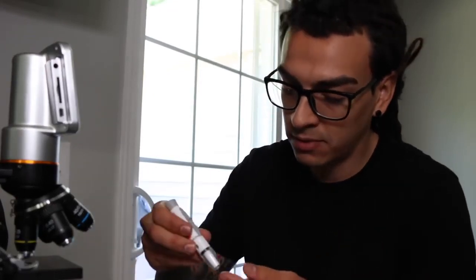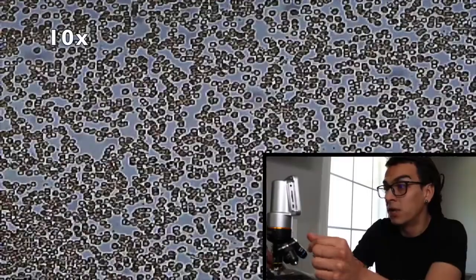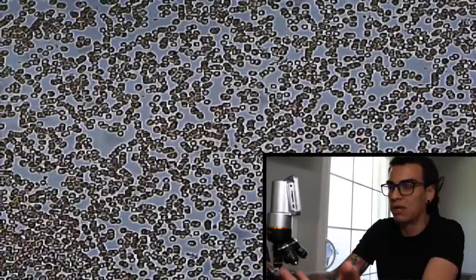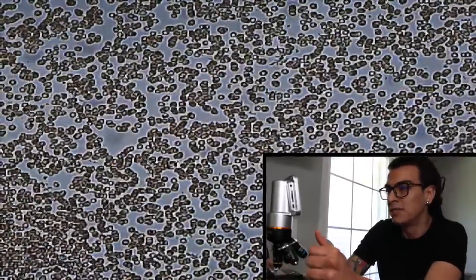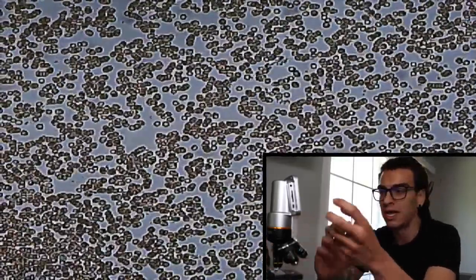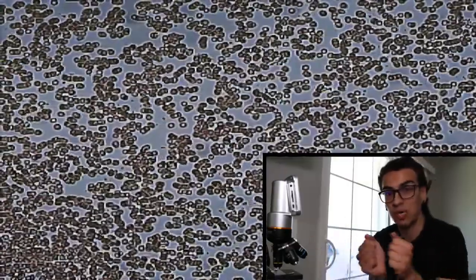All right, guys, so it's been 10 minutes since I drank 12 ounces of coffee with almond creamer. So I'm gonna be testing my blood again and see if we can see any differences. All right, so right now we are looking at my blood at 10 times zoom. They are moving a lot more than they were, which is a good thing, right? But you can see that they're still getting stuck to each other, and that's because the blood cells are not surrounded with a negative charge around them to bounce off each other.